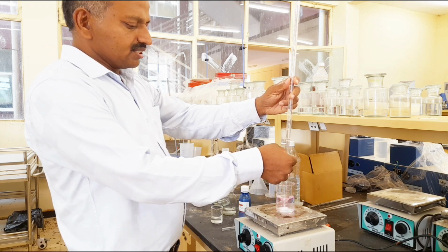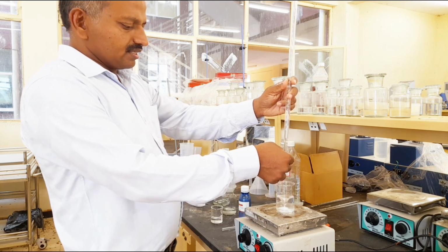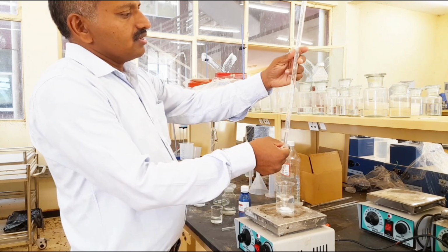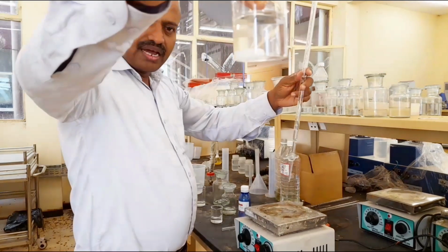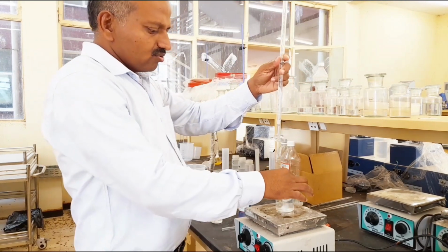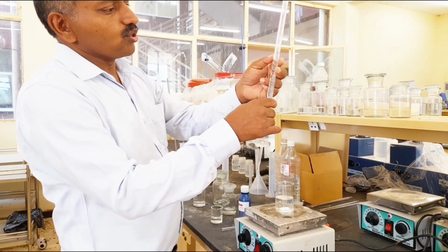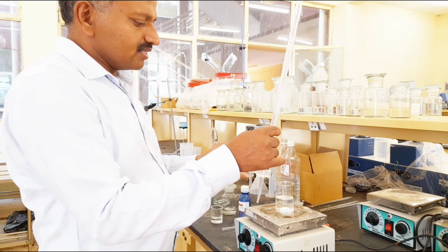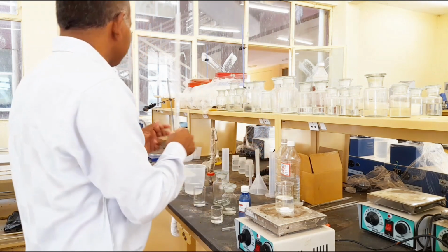Yes, suddenly the color changes. See, the color changes from pink to colorless. So you can see the change of color. Now the burette reading is exactly 14 ml. You can see the color, pink changed to colorless. So this ends the reaction. Now we can stop the stirrer. The value is recorded as 14 ml. Now we can find out the strength of this mixture, and also the composition.